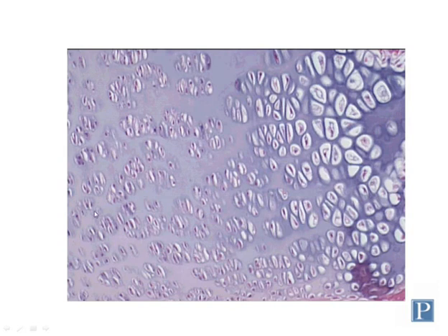Further down, closer to the diaphysis, you can see the size of the chondrocytes has enlarged, as well as the lacunae that they're found in. This is called the zone of hypertrophy because the cells are increasing in size and hypertrophying.